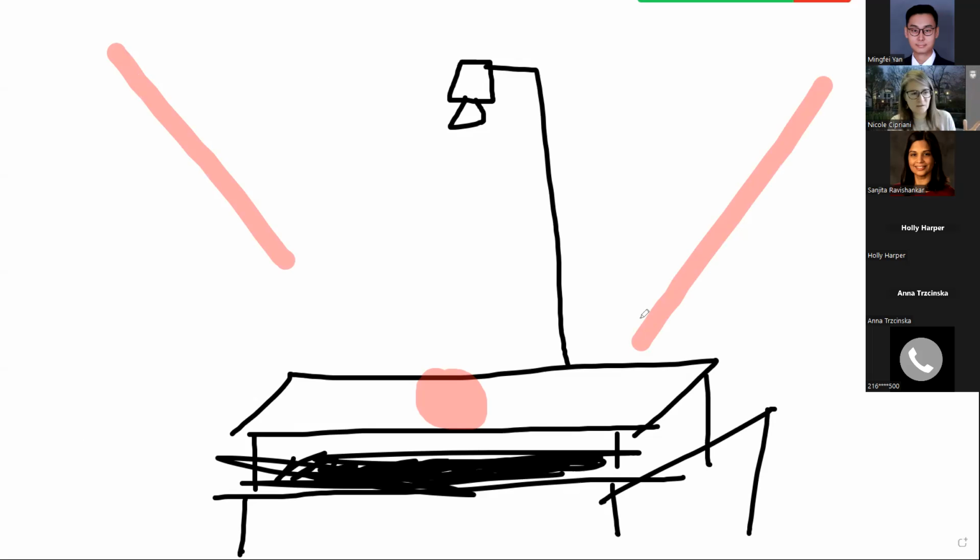You'd have to take the specimen into this private room, set up your lights, set up whatever. So it was great. But if you want to completely eliminate a lot of the background artifact, this setup was the best that I've seen, in all honesty. I haven't been able to accomplish this because, as you know, it does require a lot of effort, but it was super cool.